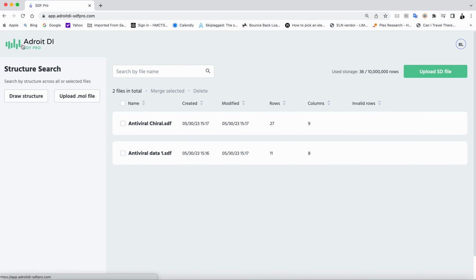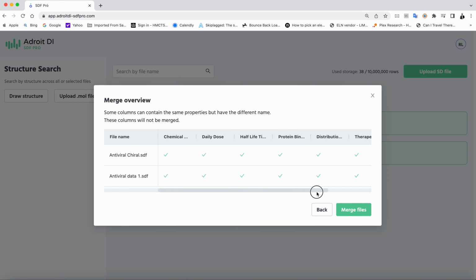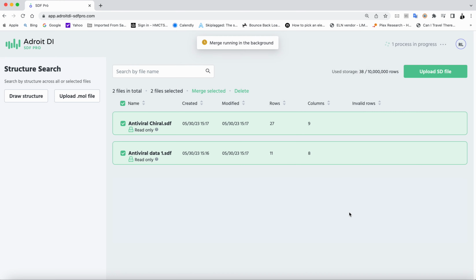So what you can do, as you're building up more and more data with your project, is merge these 2 files together. We could start off by combining them, which is just putting the data together as one. As you can see, there is an extra column there.